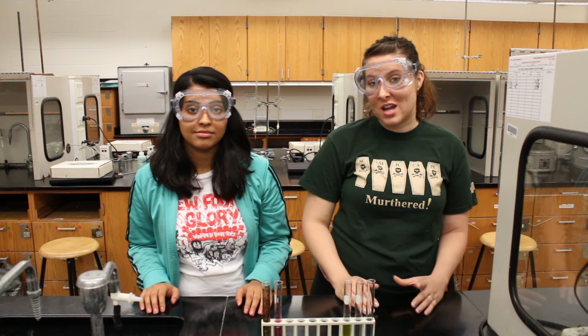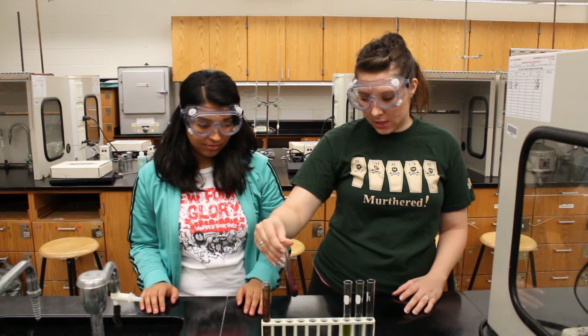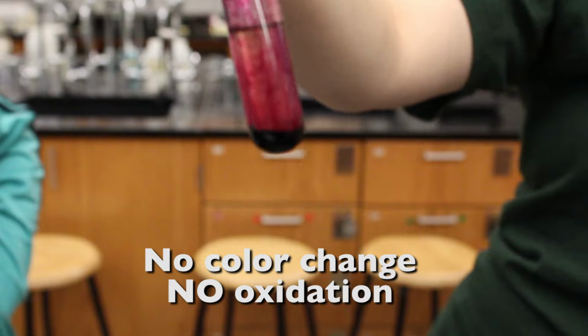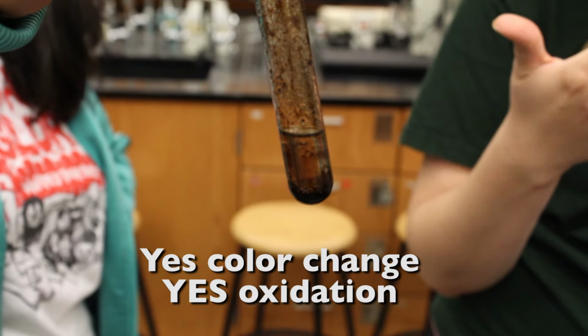When using the potassium permanganate, you'll know if the solution's undergone oxidation because the purple color will change. In this test tube, no oxidation occurred. See how the purple color remains? In this test tube, however, oxidation did occur.